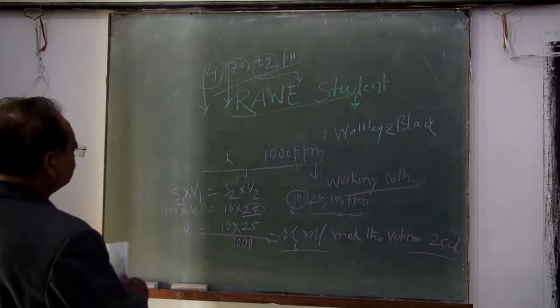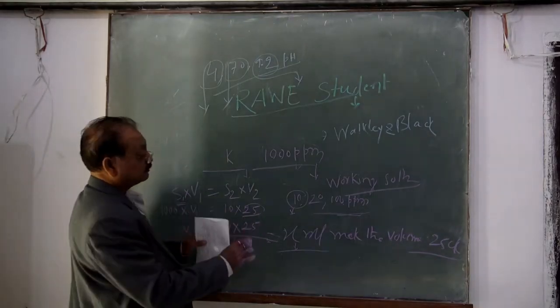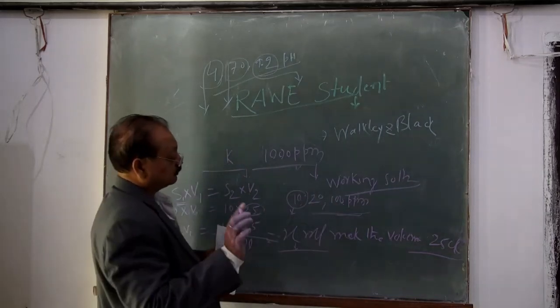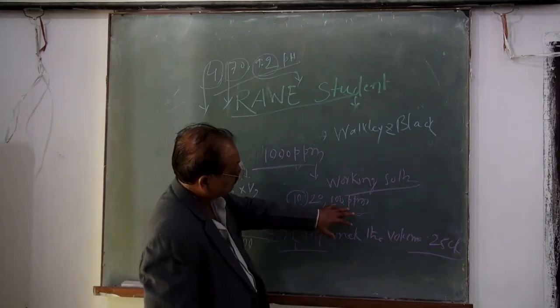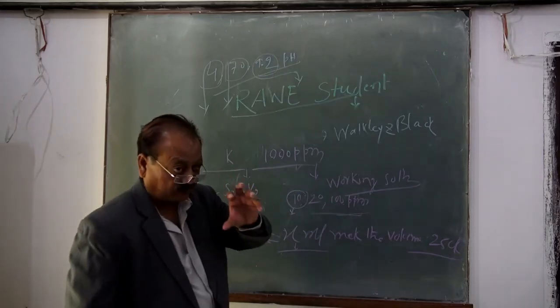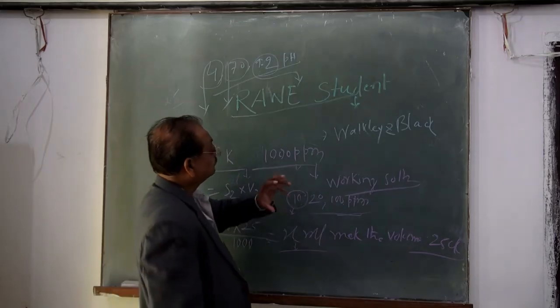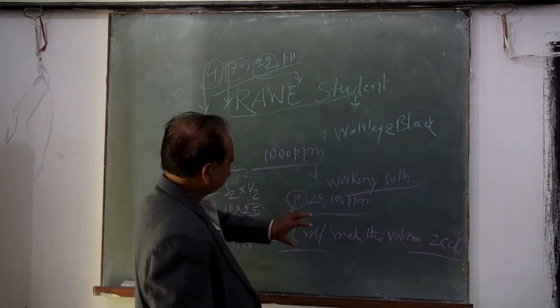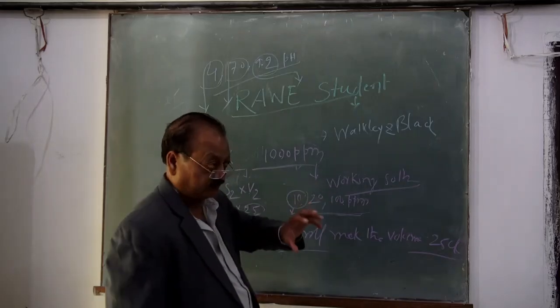This way you can prepare standard solutions of 10 ppm, 20 ppm, and 100 ppm. These lower concentrations of any solution are called working solutions.